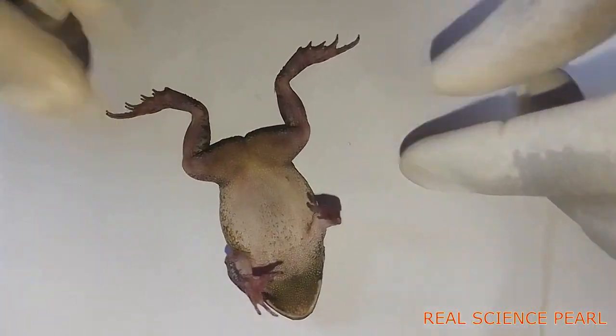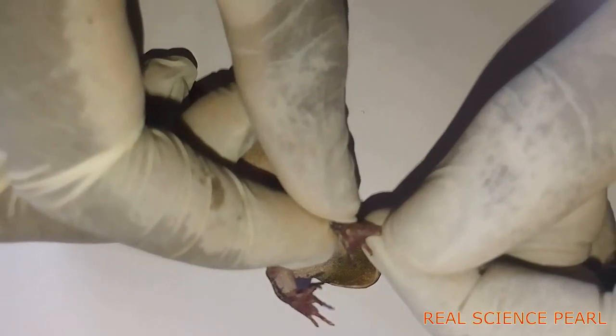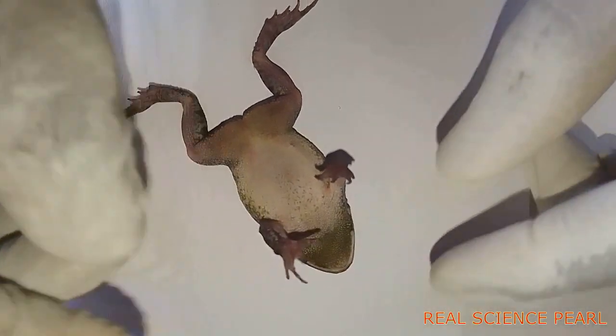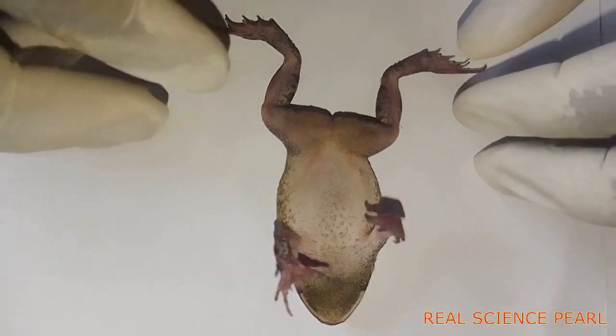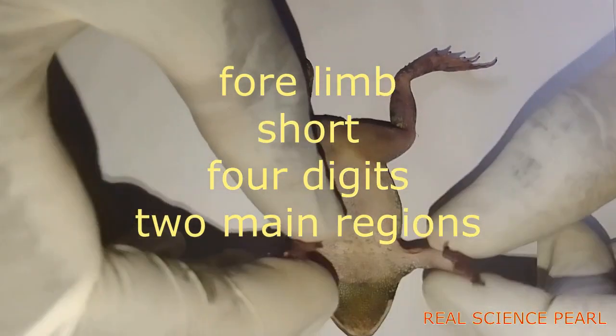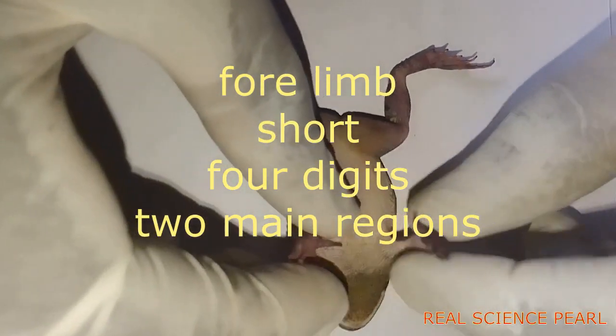Now it may be required to describe the fore limb. The fore limb is short and it's about half the length of the hind limb — that is a ratio of one fore limb to two hind limbs, or one to two.